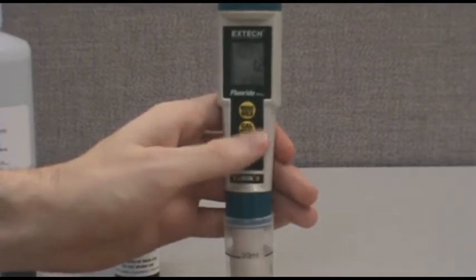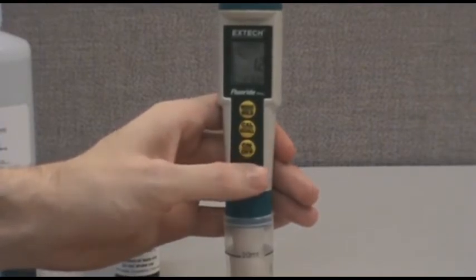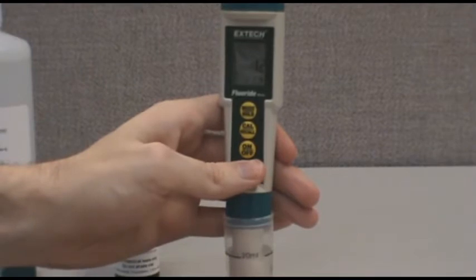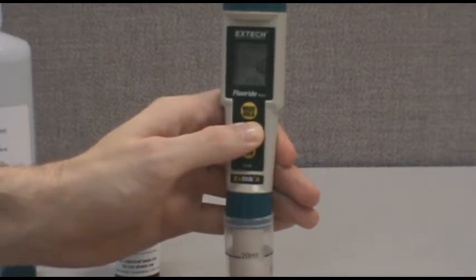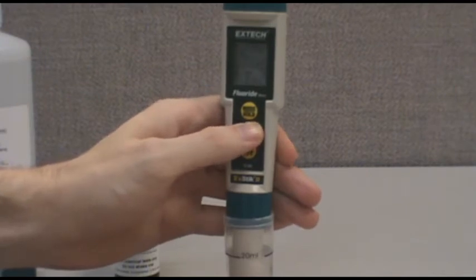Wait for the reading to stabilize. This will take approximately 35 seconds. Press and hold the Cal key. The display will cycle through the calibration values. When the display shows 1.0, release the calibration key.